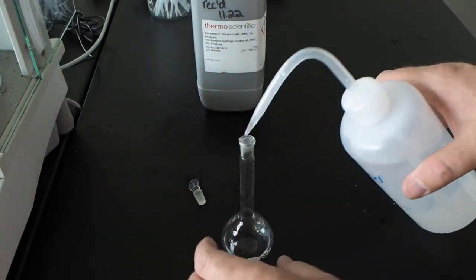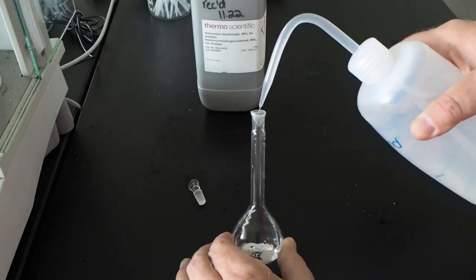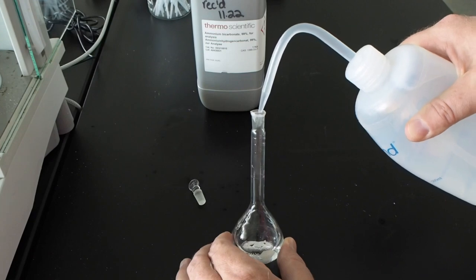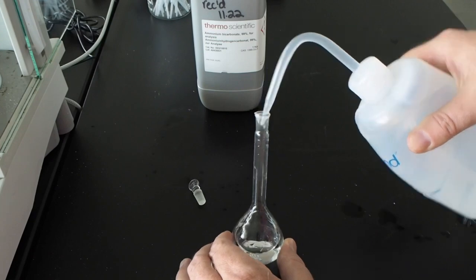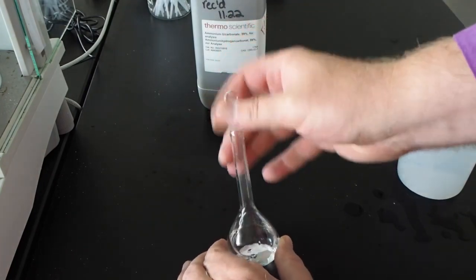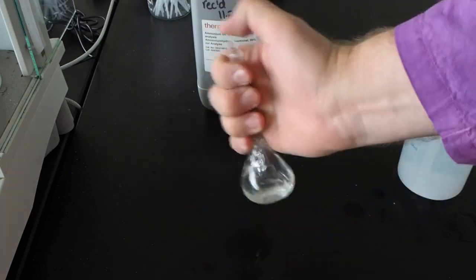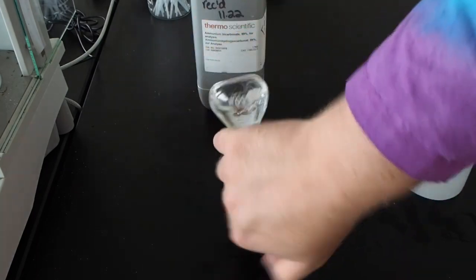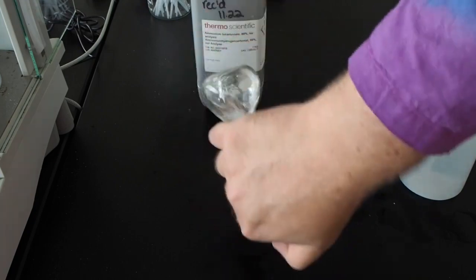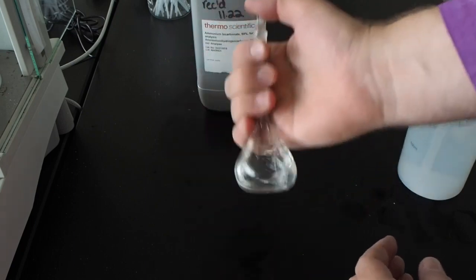I'm going to fill up this volumetric flask, but I'm not going to fill it up all the way, because the next thing I need to do is make sure my solid is fully dissolved before I fill it up all the way. Because dissolving a solid is going to change the density of the solution, and I want to make sure my final volume is right on that line there, the 50 ml line.